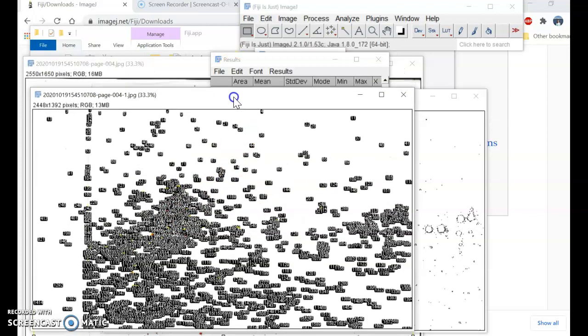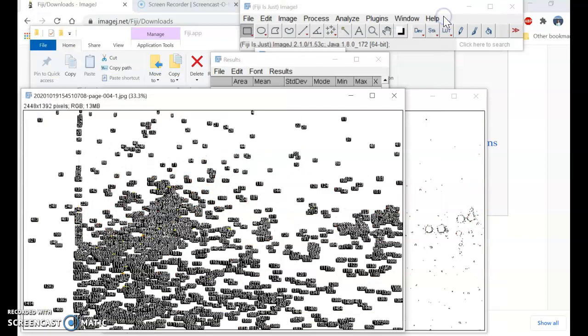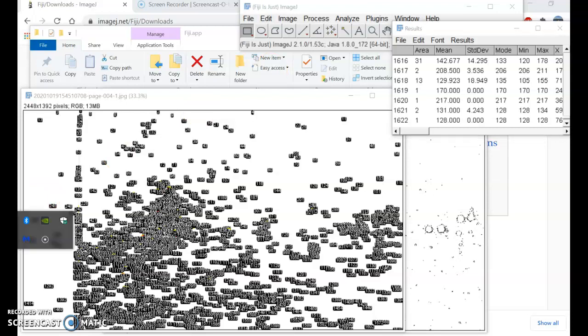So if you want to look at a particular number, you can go to this manager window, not this one. Where's the manager? This is the result, which is really nice, and this is the manager. Where is it? Did I close it? Probably.